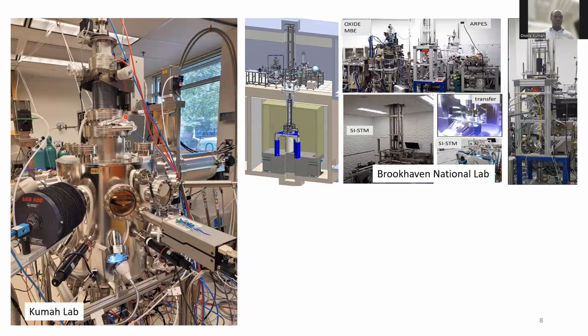And one other component you find in most MBE systems are these valves. So this straight section here is something called a gate valve, which allows you to separate your MBE system from some external tool. So in this case, if you close this valve, that will prevent this vacuum pump from working.